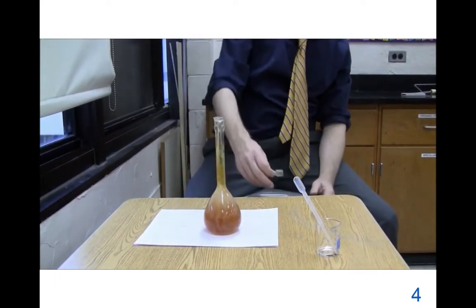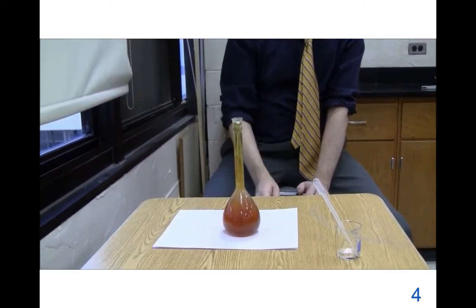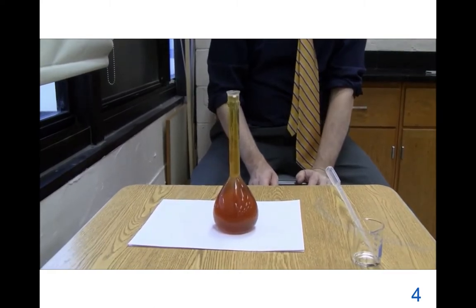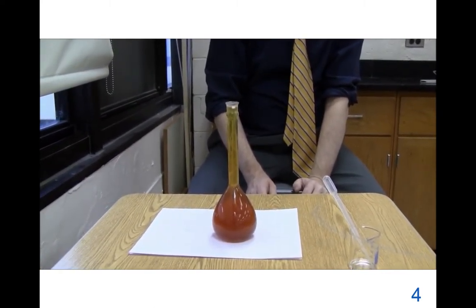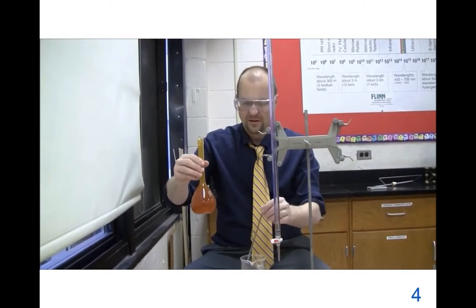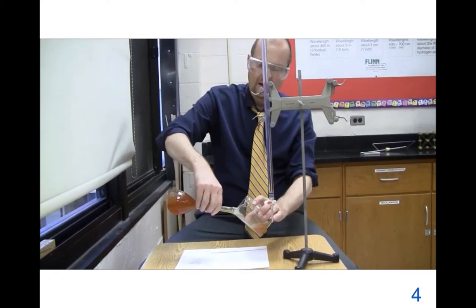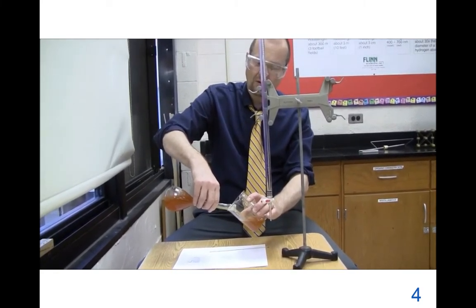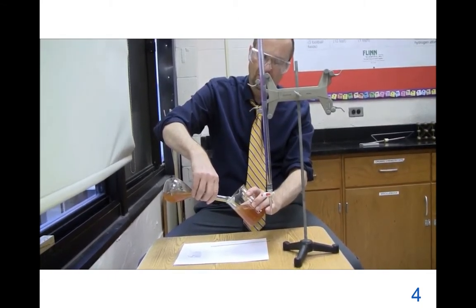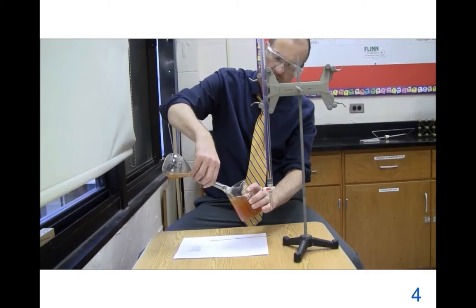Alrighty, and you can see the reaction taking place here. The new brown colour is iodine molecules being formed all the way through. And the kind of cloudy manganese 4 has turned into manganese 2. Okay, now transfer your solution, because we can't really do a titration. Oh, and you know what? It's pretty stable, but you don't want to aerate it any more than you have to. Although the number shouldn't change, because these chemicals you've added have stabilized the oxygen level. And no reason to tempt fate.